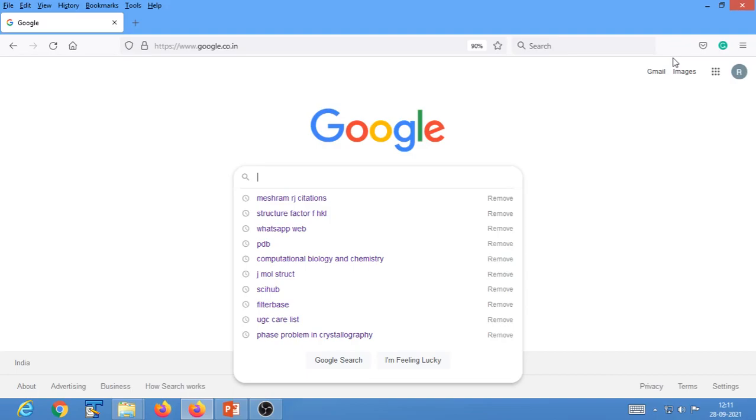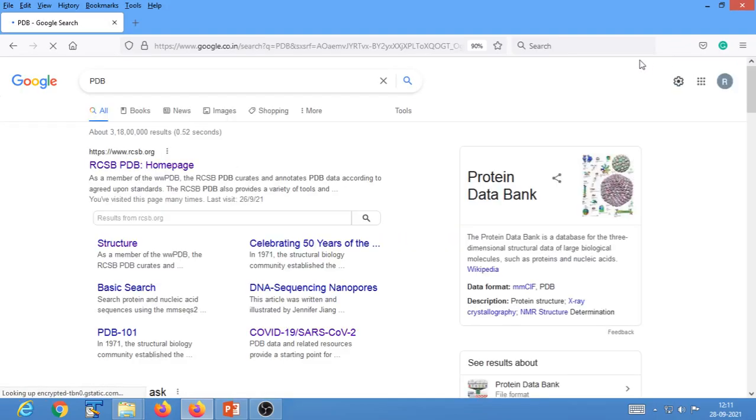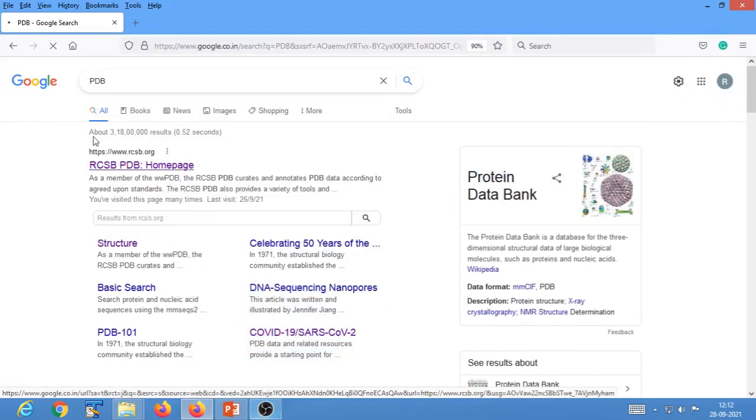Let us go to PDB. You search in Google, go to the RCSB homepage. I think the net is quite slow. Maybe we would just have to wait.